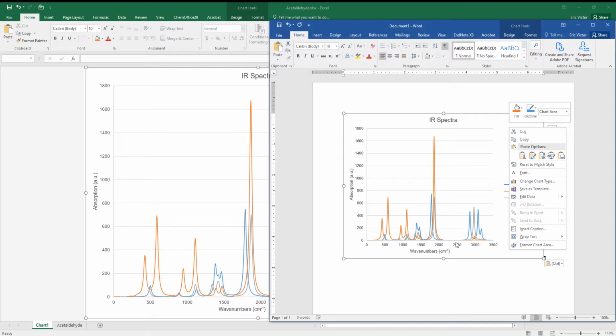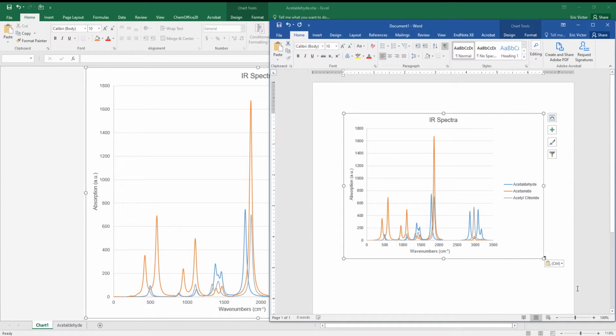I mean, you could always just simply edit it further if you needed to within here, right? But this should be good, right? Because you can just simply say like, oh, figure 1, IR spectra of derivatives, right, as our thing. And then you can just keep on working. And then this way, everything is just simply a single figure in here and everything looks good, just as you would want it to be.